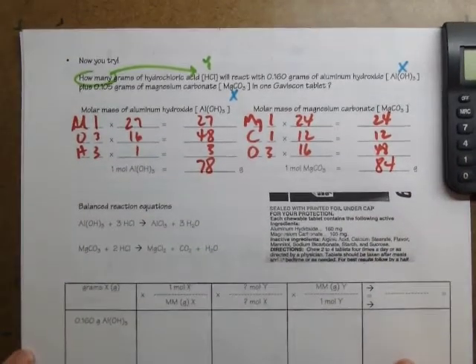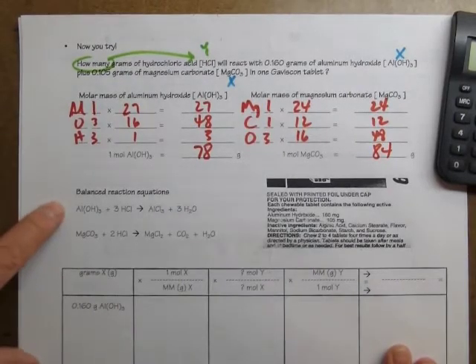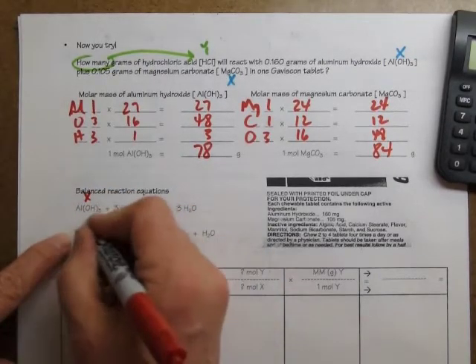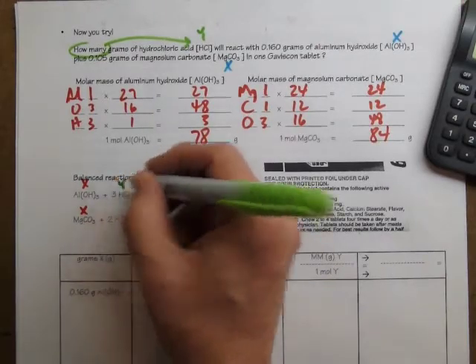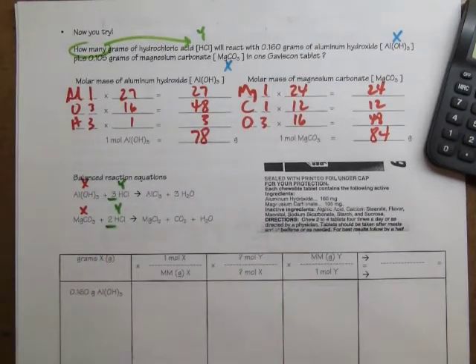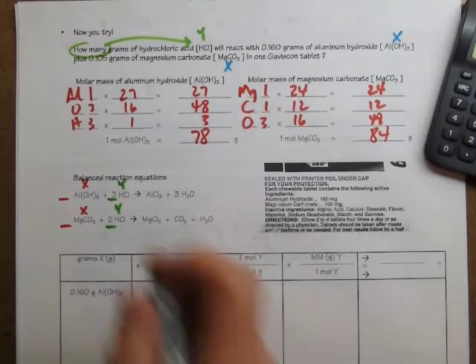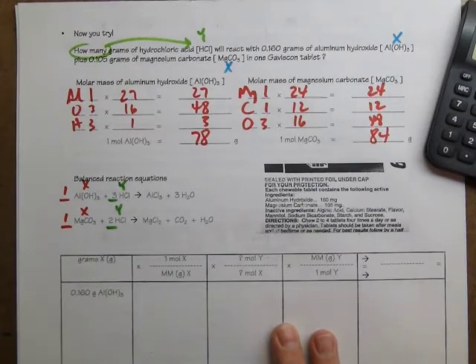Now, we'll do two calculations. One calculation for the aluminum hydroxide. That's the one that we know, so that's going to be our X in the first calculation. And in the second calculation, it'll be magnesium carbonate. And why we're doing the calculation is to find out how much hydrochloric acid can be used up. So we need to know those coefficients. The aluminum hydroxide and the magnesium carbonate don't have numbers in front, so that means that there's one of those in the balanced reaction equation.